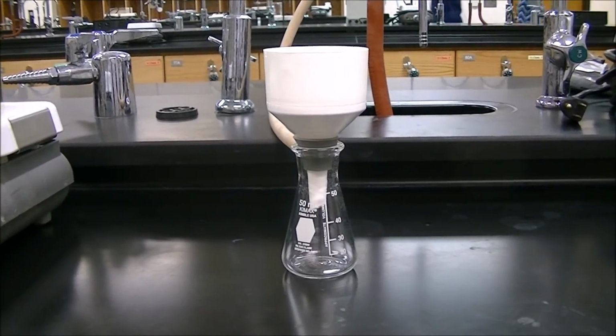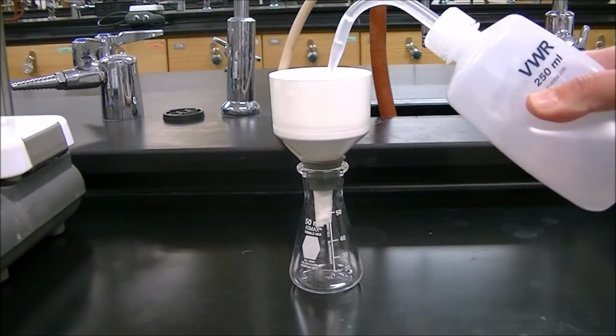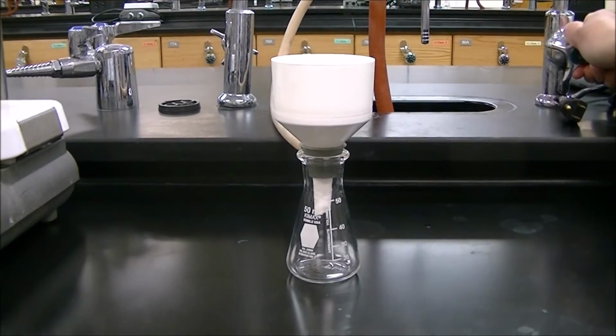Add the filter paper to the filter apparatus and rinse it with distilled water. Make sure to turn on the sink so you can create a suction.